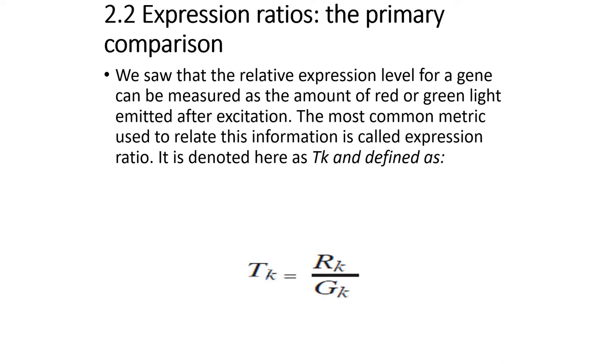As I have already told you, we can take the green dye for samples from aerobic conditions, and the red dye for genes expressed in the anaerobic condition.